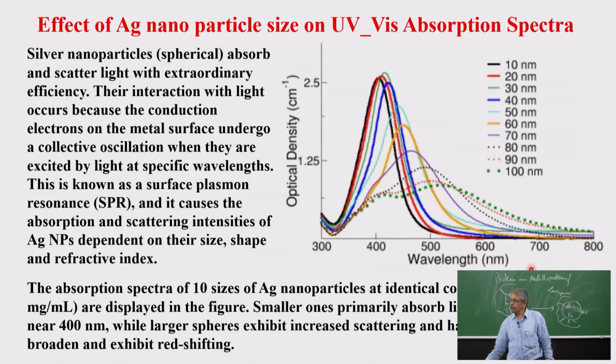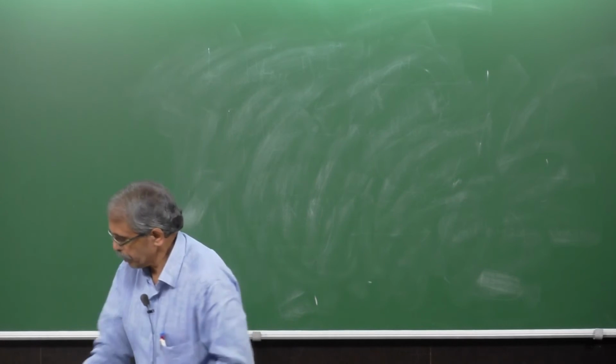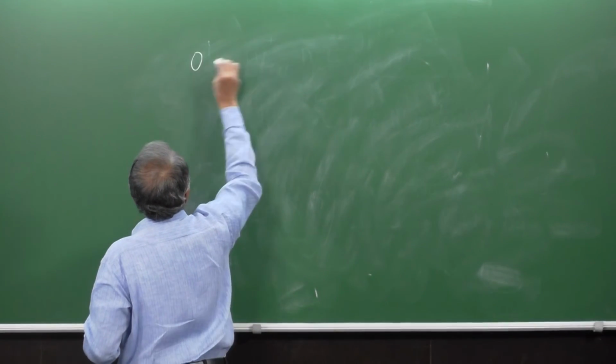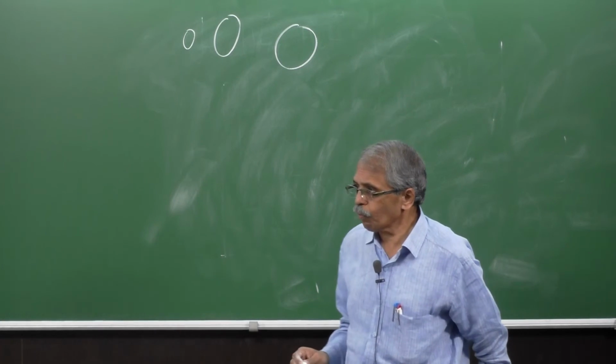So for example, the silver nanoparticles can be prepared in a variety of shapes, sizes, etc. These can also be studied by UV visible absorption spectrum. Suppose you have different kinds of these, let's say silver nanoparticles. As I said, they can be in different shapes, sizes, etc. Let's take the spherical itself, one bigger, etc., and then other kinds of shapes that will come in a while.